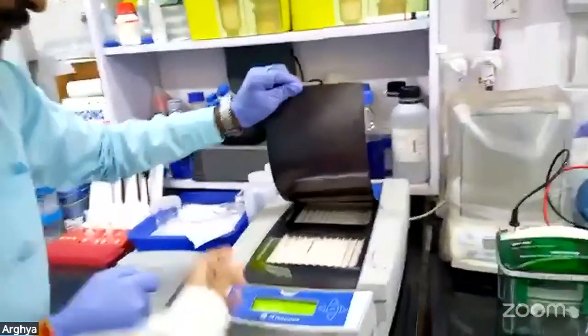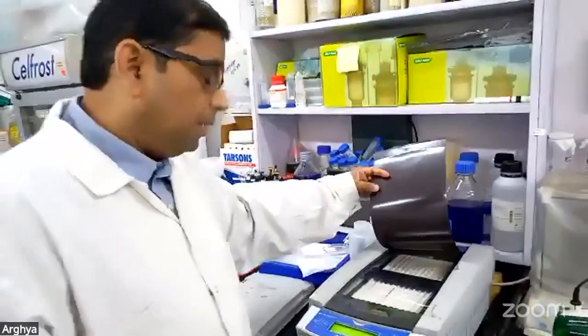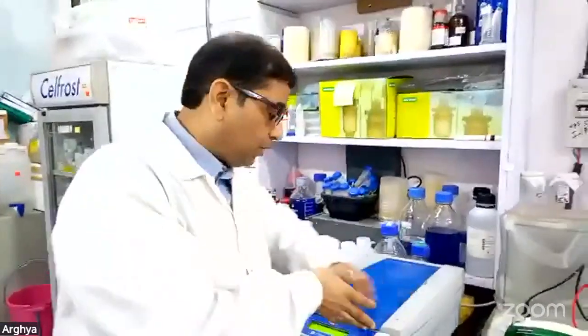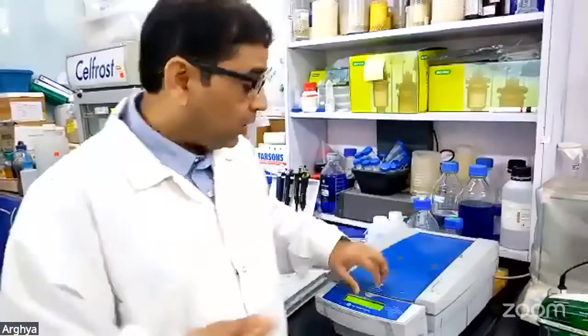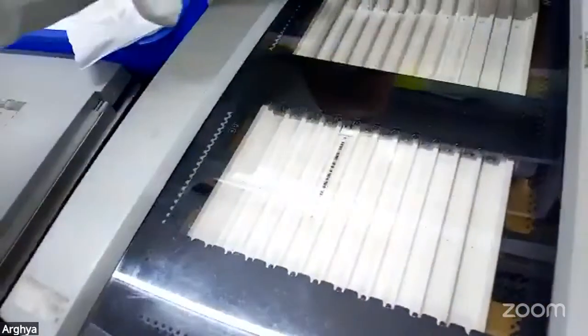All right. So the idea is, here a lot of optimizations can be done, depending on your goal. If your goal was to look at only a simplified complex, as I said, like for interactomics, we should just look at the smallest strip, like what you see here, a 7 centimeter strip, which is very small. But if your goal was to look at a complex proteome, which has 5,000 proteins, you should look at a very long IPG strip, which is 24 centimeters long. And that's where it will take you several hours. If you can zoom in here. Now this can be the full length of the tray.